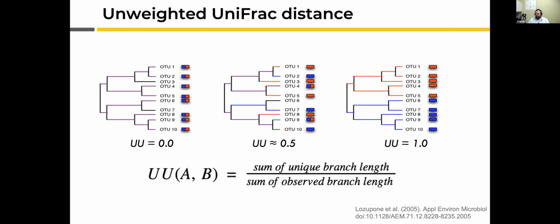There's also a variance-adjusted weighted Unifrac distance that looks to see if sequences are randomly distributed among the leaves of the tree. And there's a generalized Unifrac distance that contains an extra alpha parameter controlling the weight on abundant lineages, so that the Unifrac metric is not dominated by highly abundant lineages, similar in a way to the Shannon alpha diversity that we mentioned. But again, this is an active area of research, so there are new papers coming out occasionally making tweaks and differences to these distances.